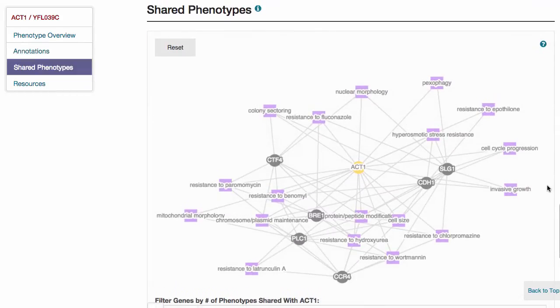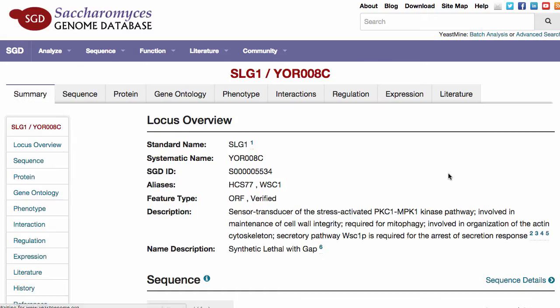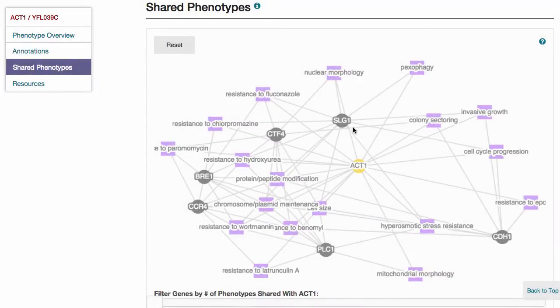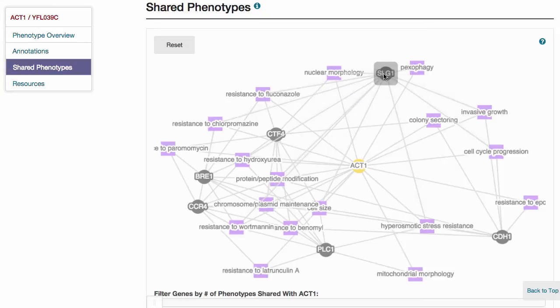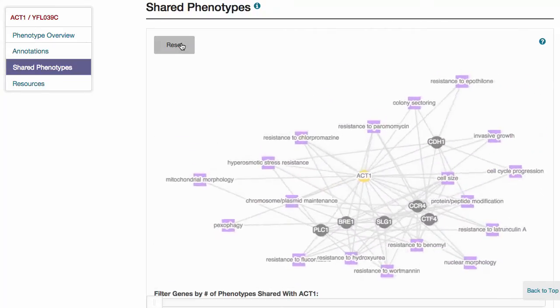Below the annotations table is the shared phenotypes network diagram, which allows you to visualize connections between different genes in the form of phenotypes they share. Click on a gene or a phenotype observable name to go to a specific page within SGD. Drag any of the gene or observable objects around within the visualization for easier viewing. Click reset to automatically redraw the diagram.